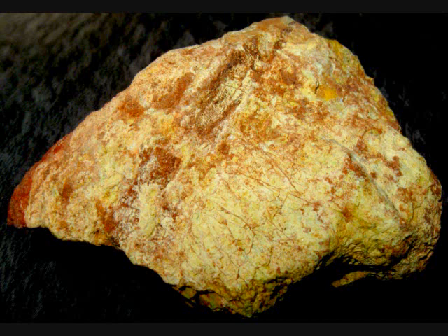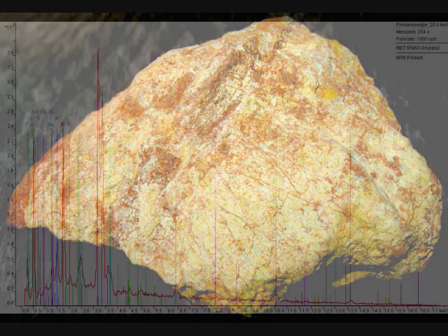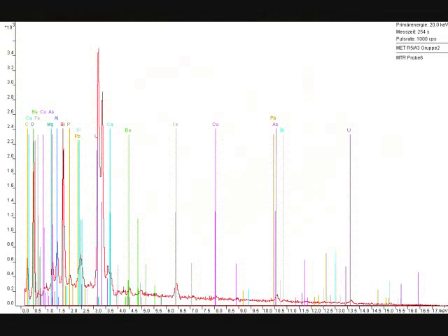So let's have a look at the next sample, which is gummite. Gummite is a mixture of all kinds of different elements, which we can see now. You can see the major peak there with uranium. By the way, if you look at my videos and search for gummite, you can also see how active this is. And yeah, as you can see here, we have a big peak that is very clear for a lot of uranium in that mineral. But to my surprise, we also found arsenic there in the middle on the right, next to lead. And yeah, as you can see, we have a crazy mixture of all kinds of elements in there: phosphorus, and magnesium, and barium, and copper, and just a crazy mixture of all kinds of elements. I really love this. Look at all those peaks. That's really almost impossible to analyze because there are so many peaks from all those different elements in there. But it's a very good example of chaos. I love chaos.